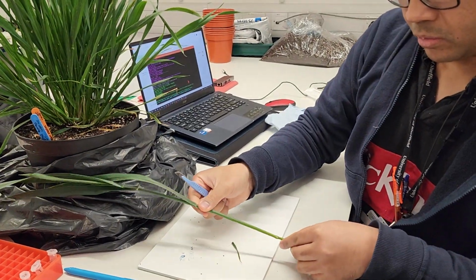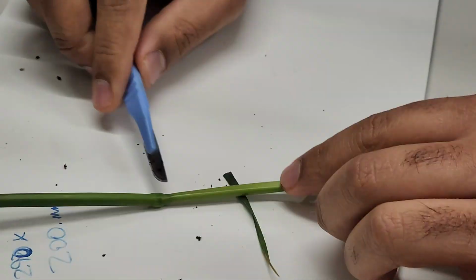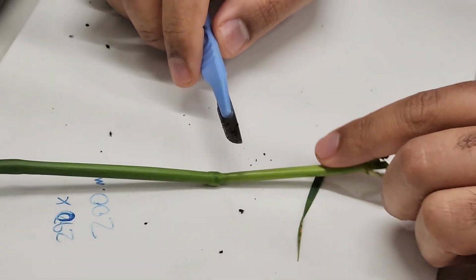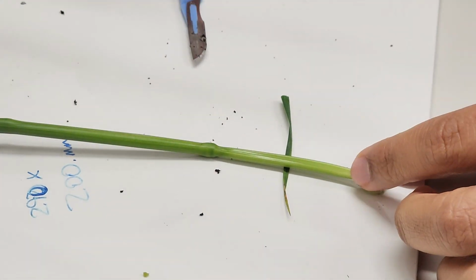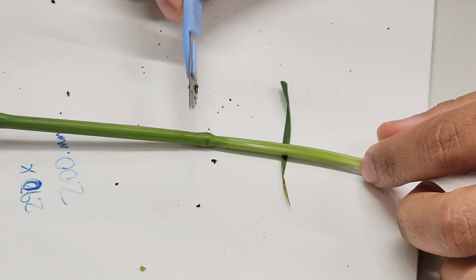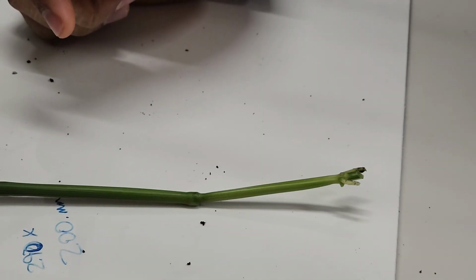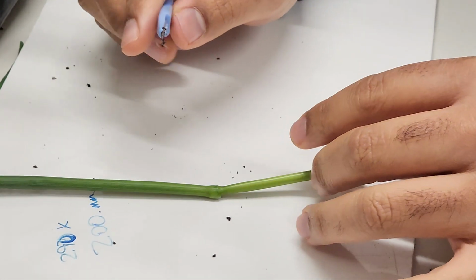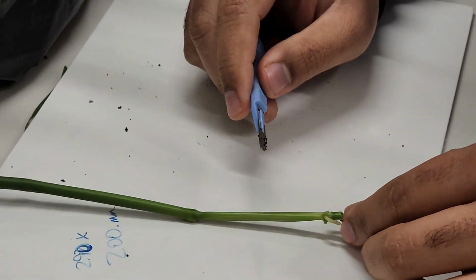So this is not like rice. Rice does not have these nodes and internodes. Have you seen rice got internodes? It's clean. One culm. Rice does have internodes. It's called stem elongation during the reproduction, but that's kind of hard to see, and it's very minimal.